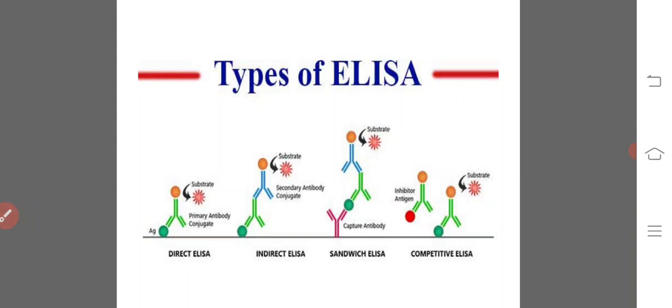The enzymes that are used in ELISA include beta-galactosidase, glucose oxidase, peroxidase, and alkaline phosphatase. The ELISA technique is mainly based on antibodies, and some antigens can absorb to wells of the molded polystyrene plates without losing their immunologic capabilities. Antigen and antibodies can be linked to enzymes to form complexes that are immunologically or enzymatically functional. So there are different types of ELISA.